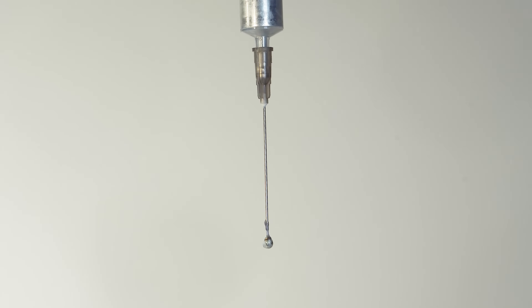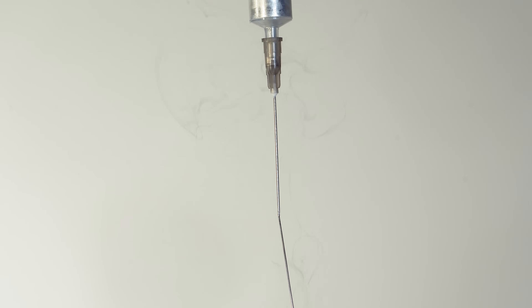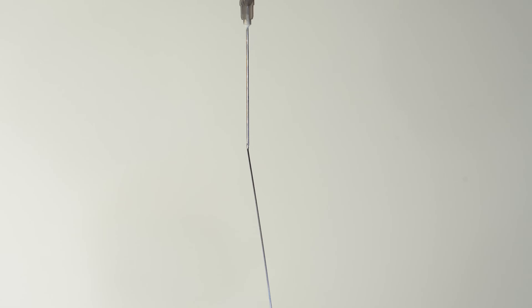If we pour the alloy onto any surface, it will most likely catch fire – although as you saw earlier, it can also catch fire on the tip of the needle.